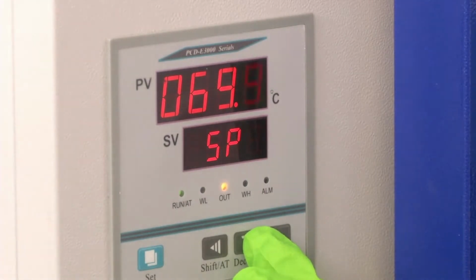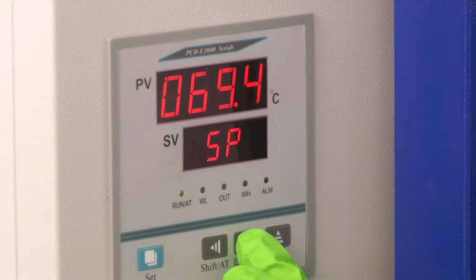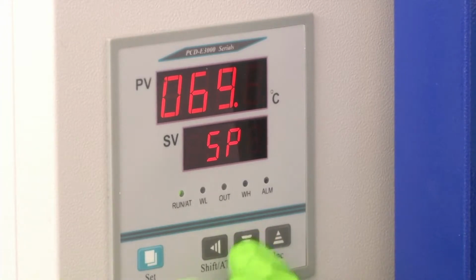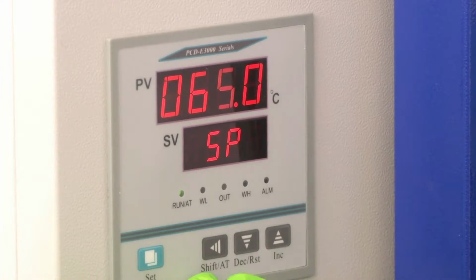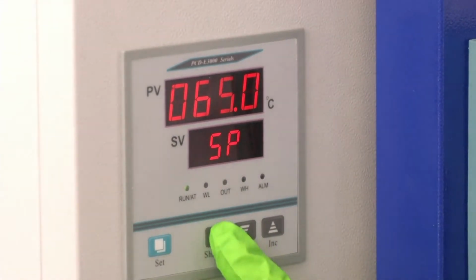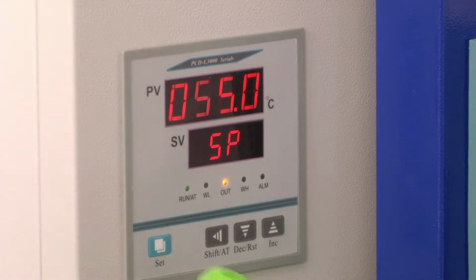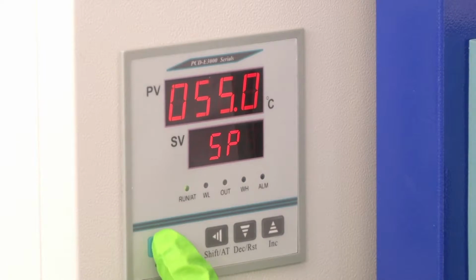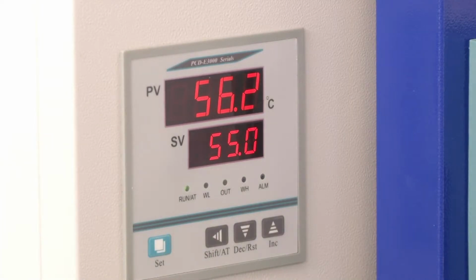Let us say we will keep it at 55 degrees Celsius. Suman is adjusting it. Instead of decreasing the decimal place, he can shift the decimal place using the shift key. Just show them the shift key. This is the shift key that is available. If you click that, it can shift the decimal place which you want to decrease. Now because he has to go to 55, he has changed 6 to 5. He has set it to 55 degrees Celsius. Let us see what the set value is. It is 55 degrees Celsius.